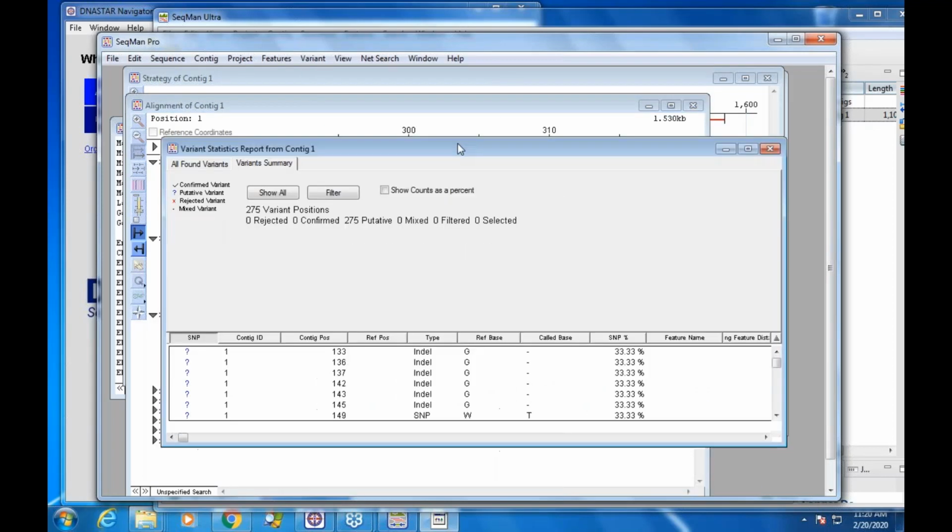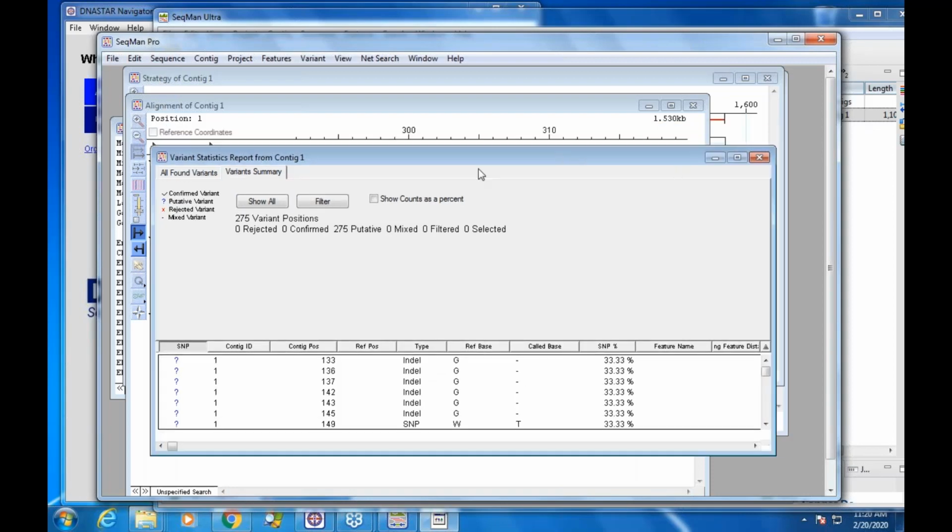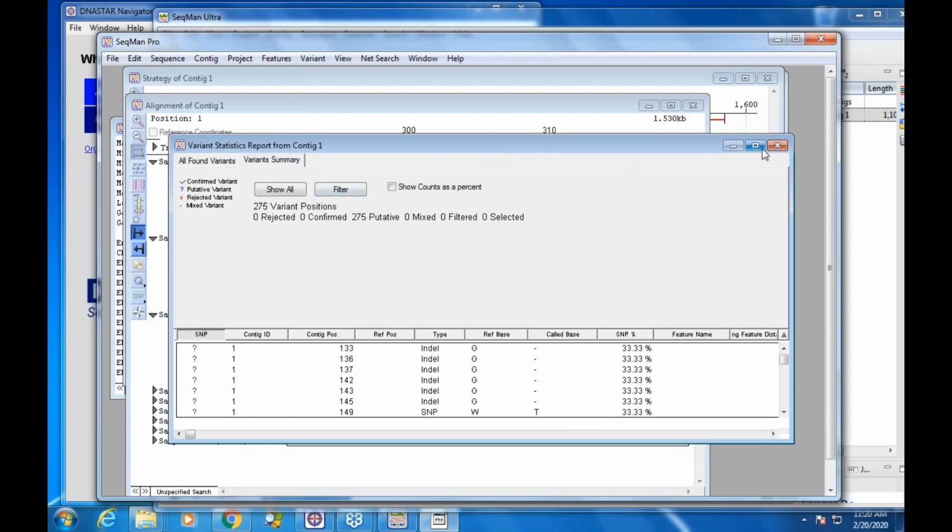What this was really showing was the difference of the aligned reads to the called consensus. So it wasn't quite accurate to call it a variant report. I mean, it is variations, but folks would use this to navigate to find problems in the consensus. But you can actually miss some of those areas using this table.